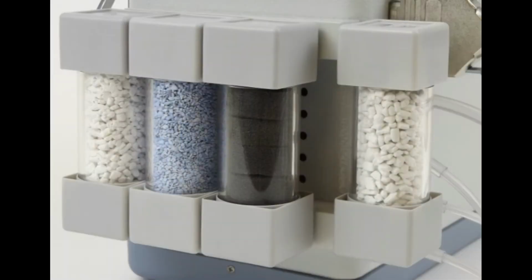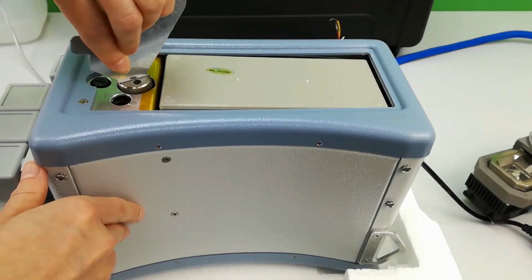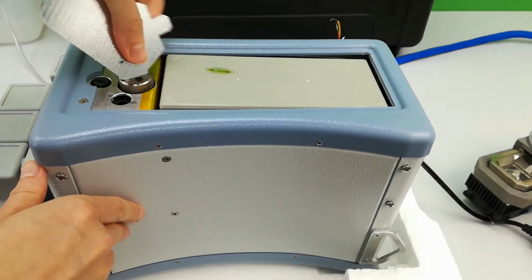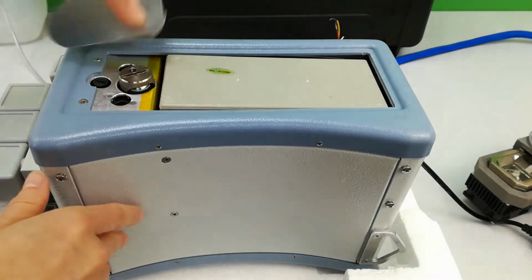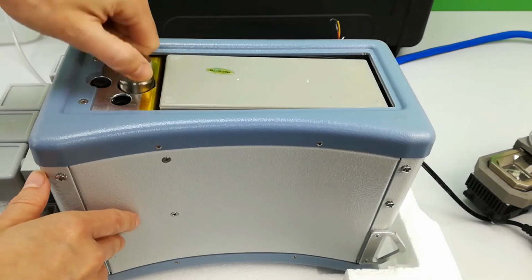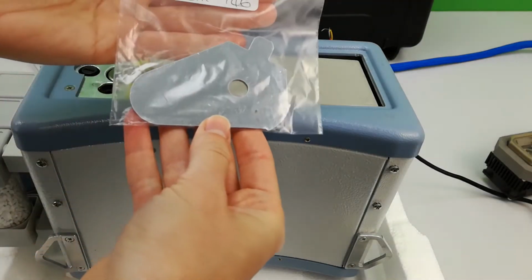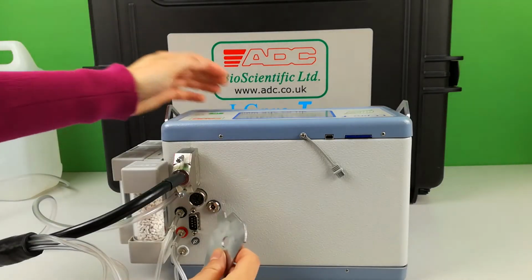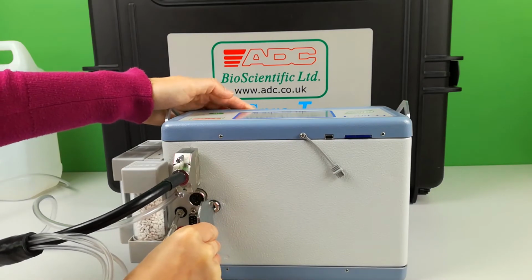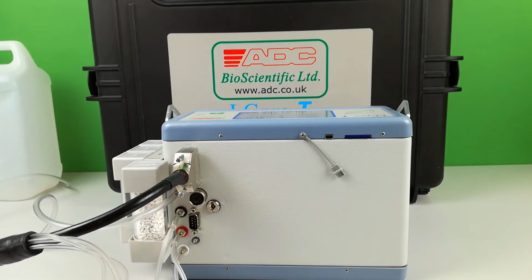Next, remove the battery compartment cover and, using tool LCM146, remove an empty CO2 cartridge. To ensure that the CO2 cartridge is empty before removing it, use tool LCM146 at the narrow end and press this into the safety valve, which is found next to the electrical connections on the front of the LCpro console.